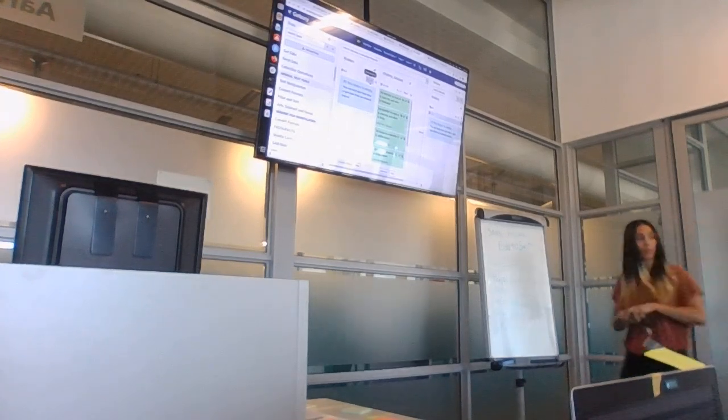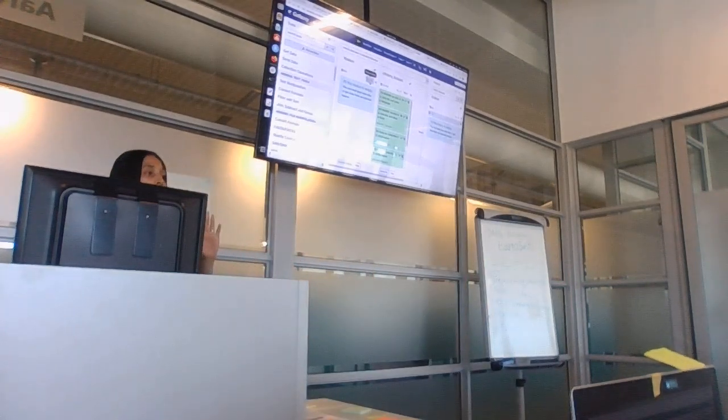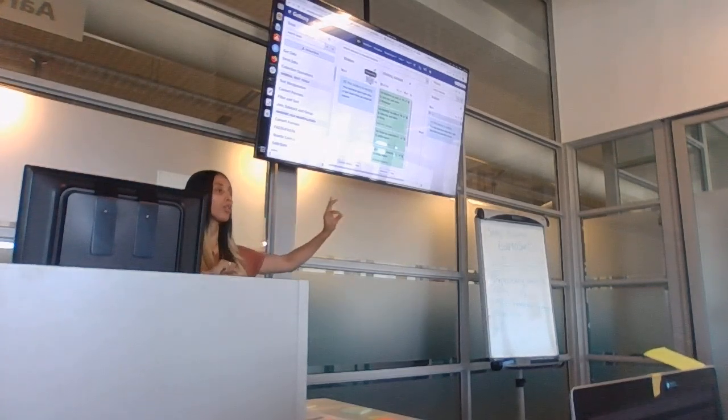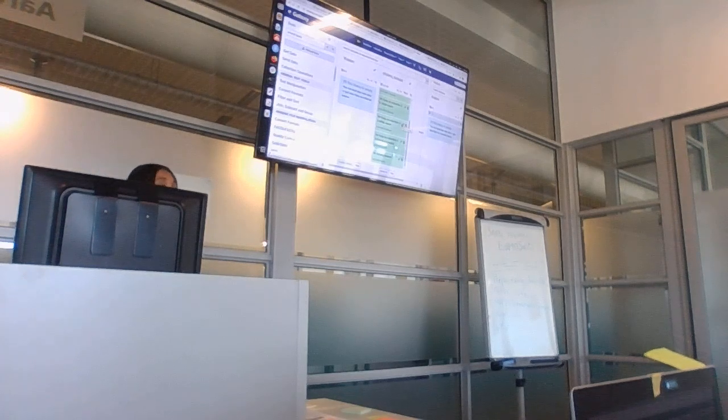So I hope it's clear what we're doing. We want to move data between two directories or two histories. It's almost like when you have your desktop open and your downloads folder open, and you want to drag something from your downloads onto your desktop. So we want to drag the file that we had an issue with that was highlighted with a high GC content.